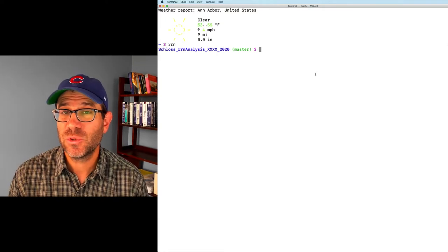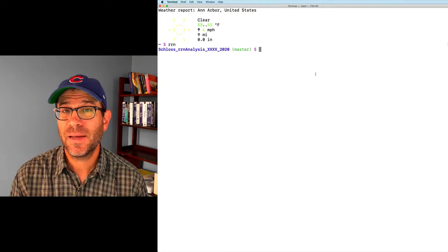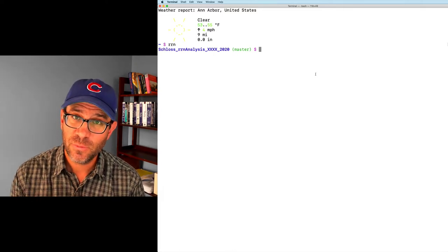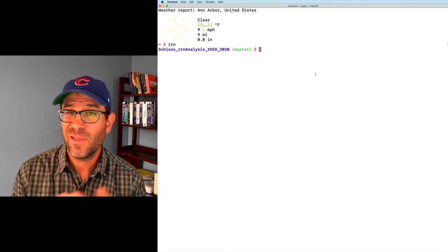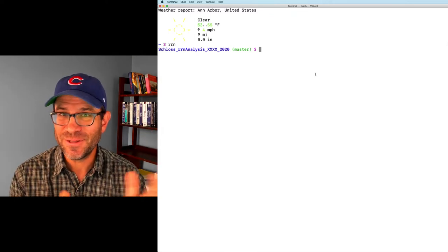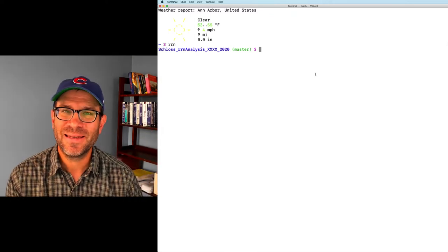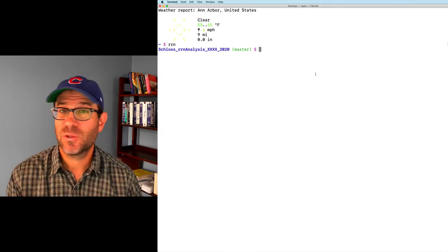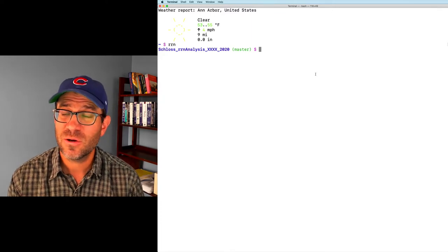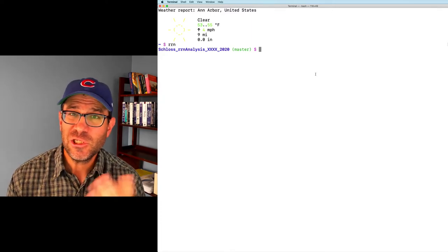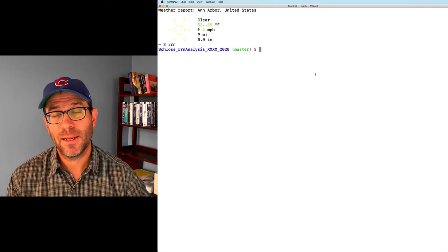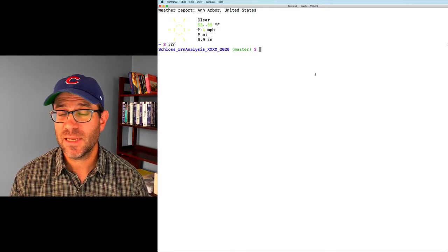What we'd like to do is combine data from the full-length sequences, the V4 region, the V3-4, and the V4-5 region all into one mega tibble — one mega data frame that we can then use with our group_by and summarize functions as well as other tools from the tidyverse like ggplot, so that we can directly compare across our different regions of the 16S gene.